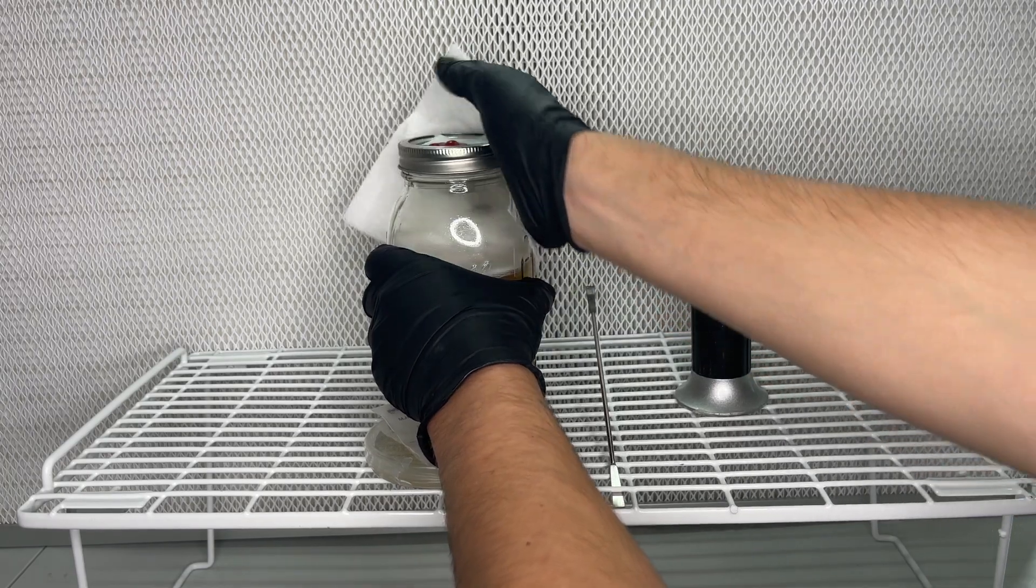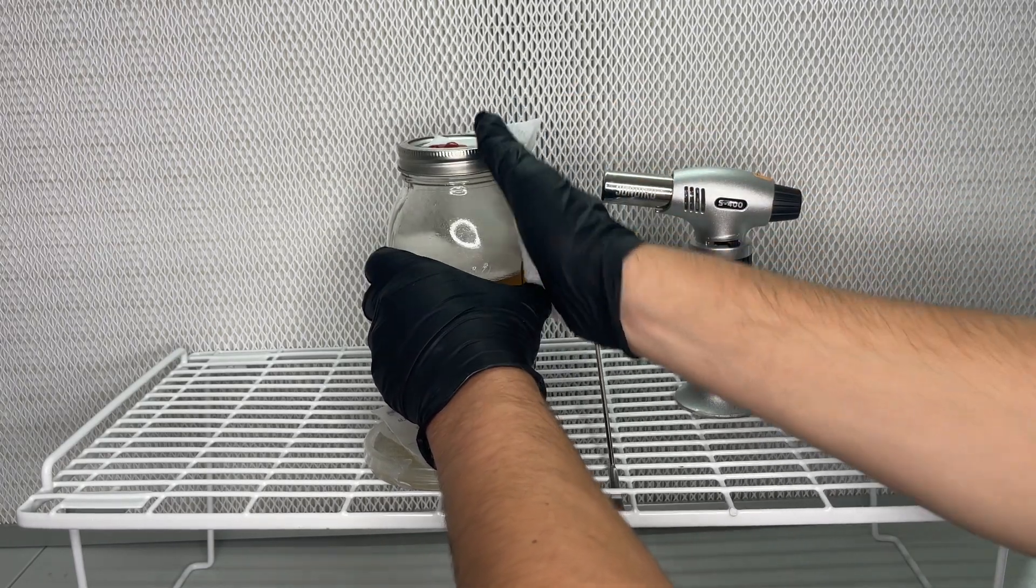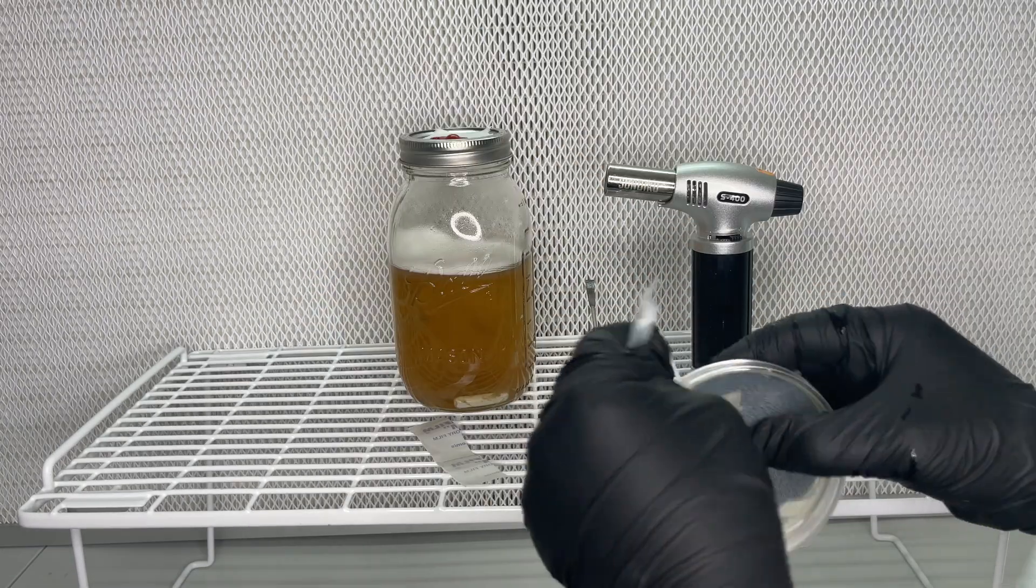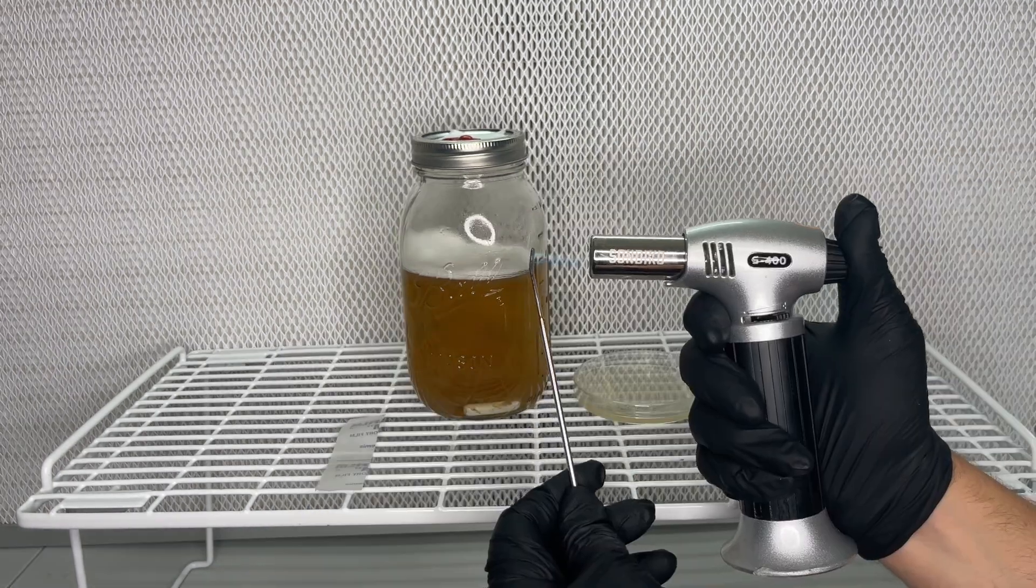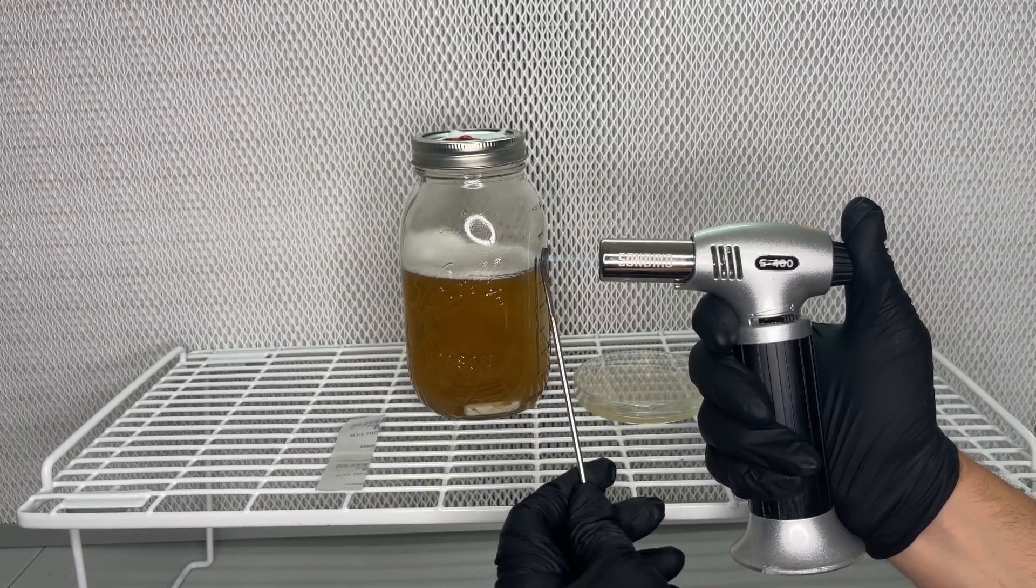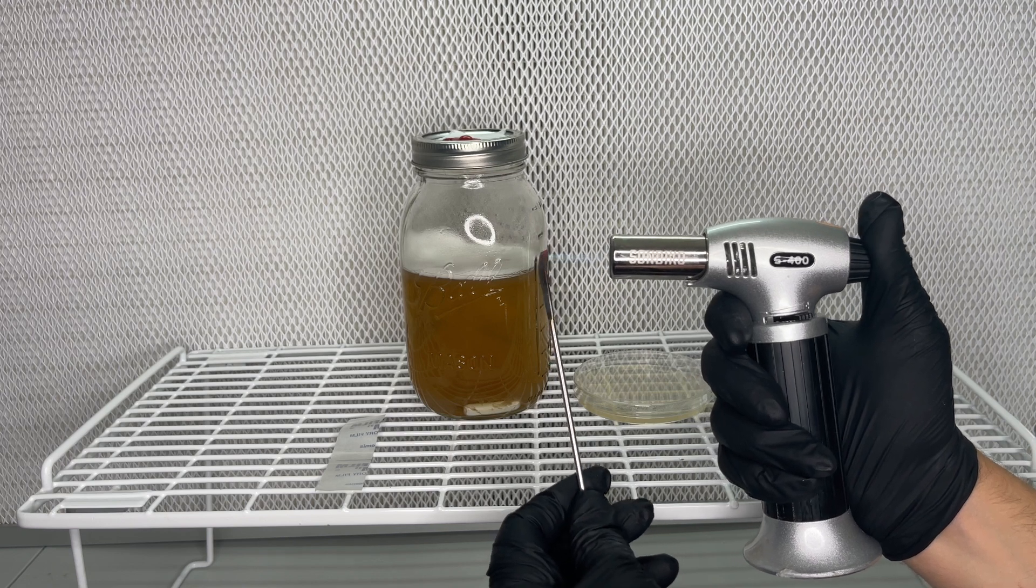And although we know that the liquid culture is contaminated, the mycelium growing up the side of the glass, away from the contamination, will allow us to actually isolate the mycelium on an agar plate.